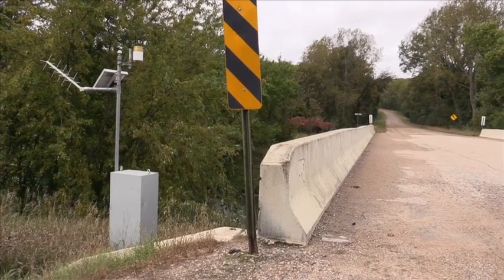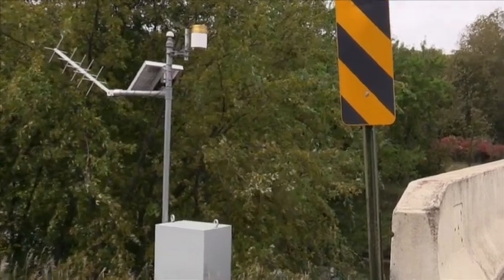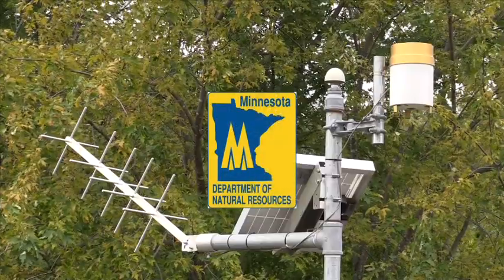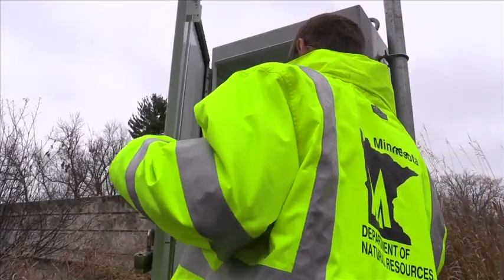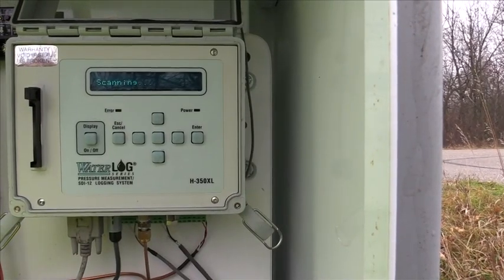At most of the network monitoring sites, there is a structure with equipment that tracks the stream levels. Most of these structures are owned by the United States Geological Survey, the Minnesota Department of Natural Resources, or the Army Corps of Engineers. It is valuable to obtain the reading from the data logger when sampling. This program provides a tutorial on how to do that.